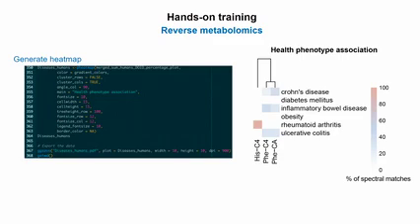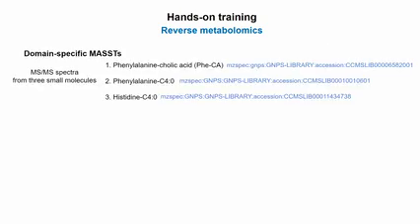So what you need to do once you get that is get to the validation part, where we need to go back to the raw data and start to do the stats on it. But at least this gives you more information than you previously had on these specific molecules. And this is what you get from here.